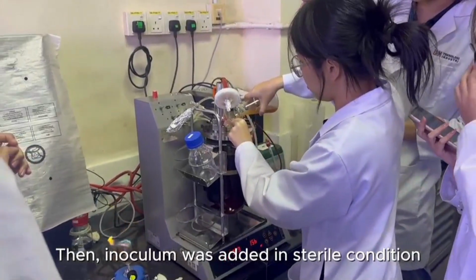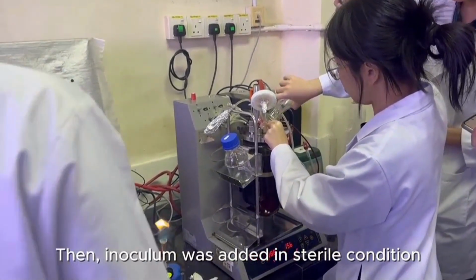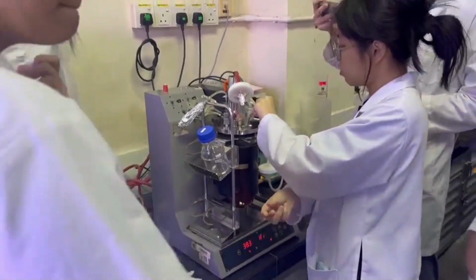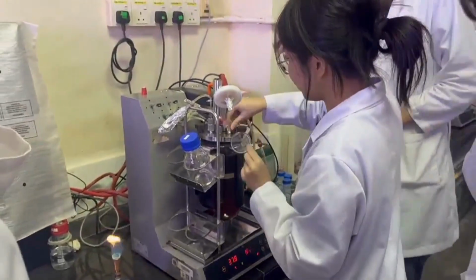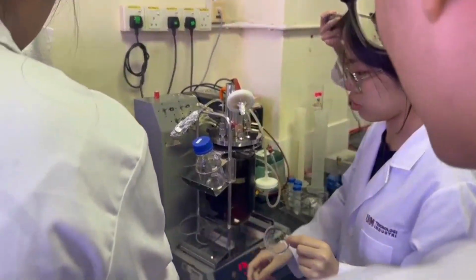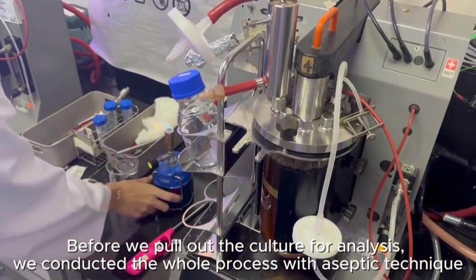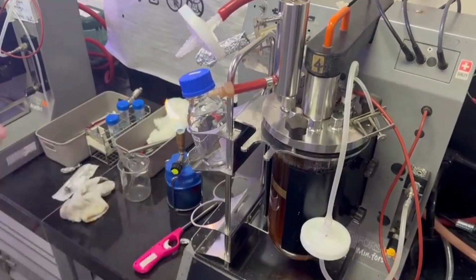Step 4. Inoculation. Then, inoculum was added in sterile condition. Before we took out the culture for analysis, we conducted the whole process with aseptic technique.